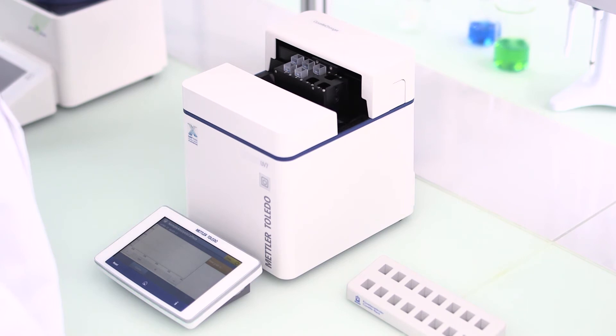From one instrument to another, with LabX, the user just follows the steps on the instrument screen which is common to all the Mettler Toledo excellence line of instruments.